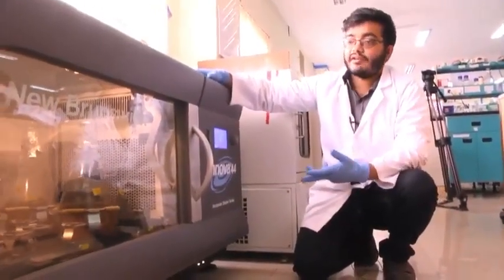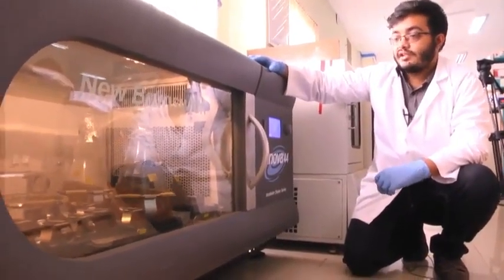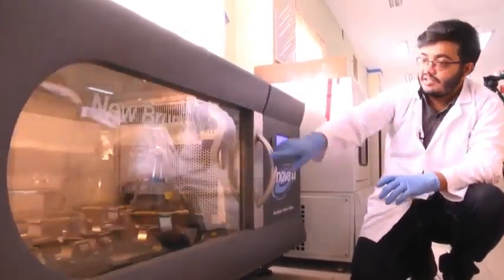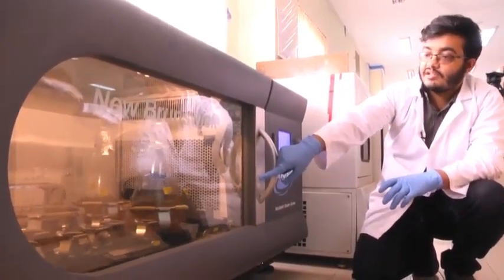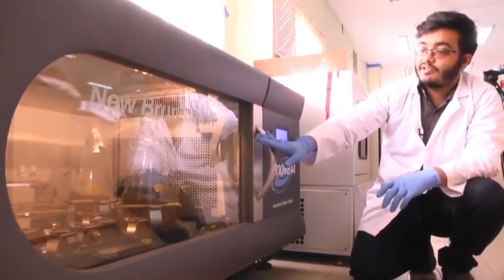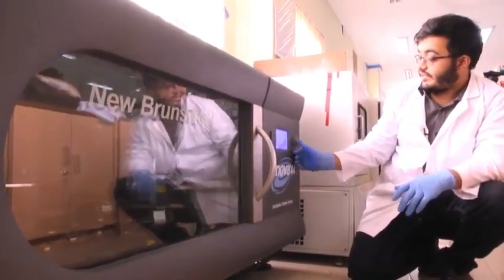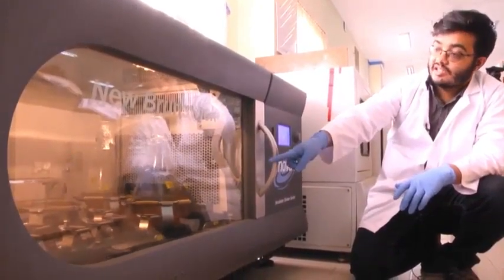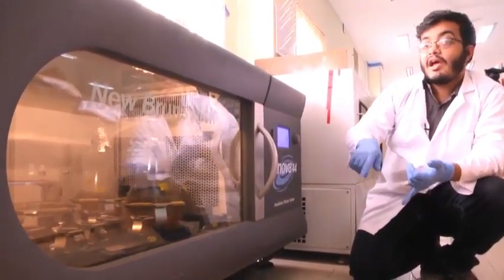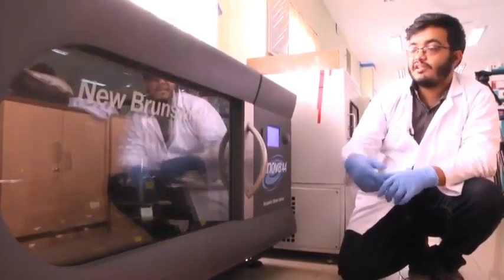So the machine that I have in front of me now is a temperature controlled shaker incubator, and the purpose of this is that it allows us to grow bacteria in a controlled temperature environment. As you can see inside, there are different flasks containing volumes of bacterial growth media in which bacteria have been inoculated, and as time progresses they will grow in a temperature controlled environment. For now it has been set at 37 degrees centigrade, and the shaking is essential because it prevents the bacteria from settling down, which is detrimental to bacterial growth. And even more importantly, it ensures proper aeration of the culture so that the bacteria can survive.